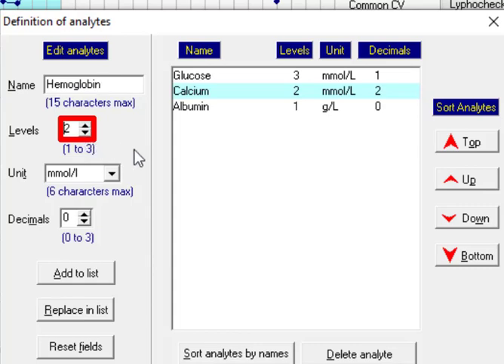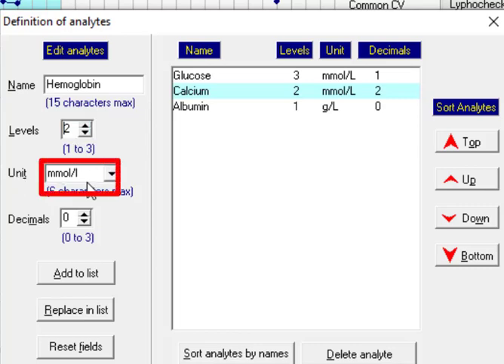In the next field we should choose the number of levels that we want to use for this analyte. I choose two levels.